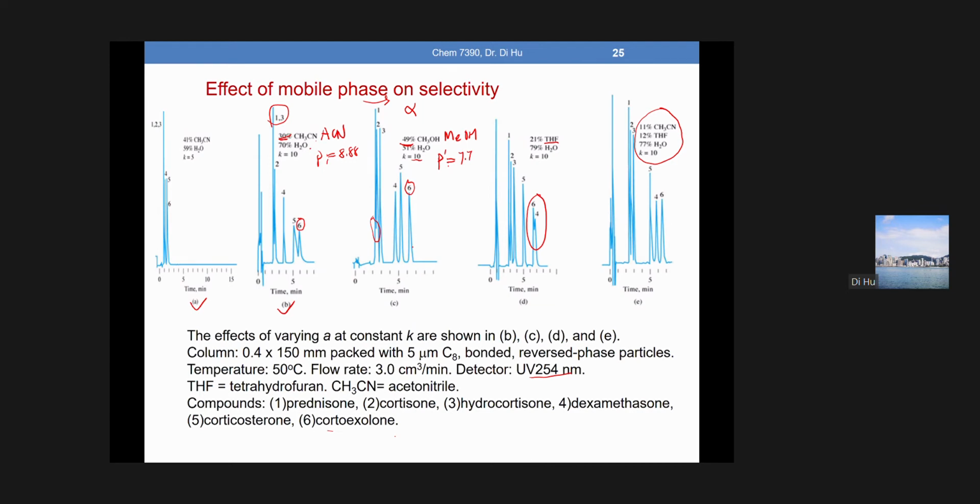Okay, something you should know is that when the fraction of ACN or methanol in the solvent mobile phase mixture is not that high, say less than 50%, ACN is considered a stronger mobile phase than methanol. That means it has higher elution strength. So in reverse phase, ACN can be used at a much smaller fraction than what we calculated to achieve the separation.